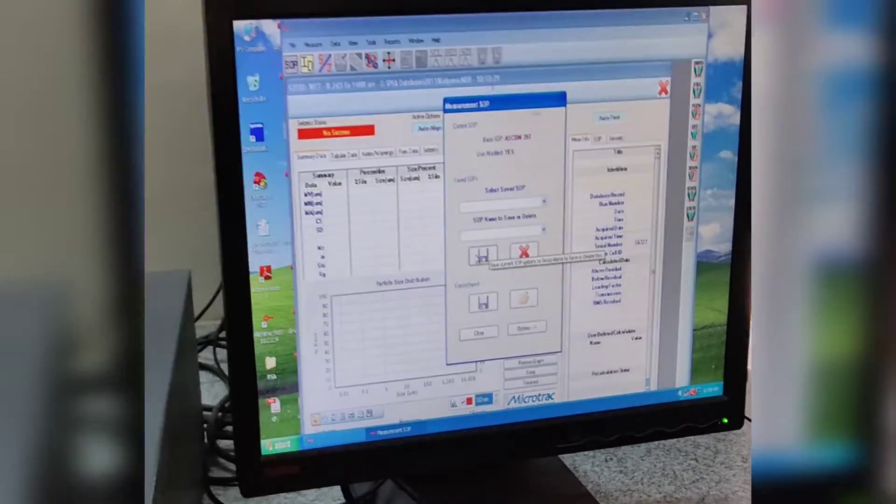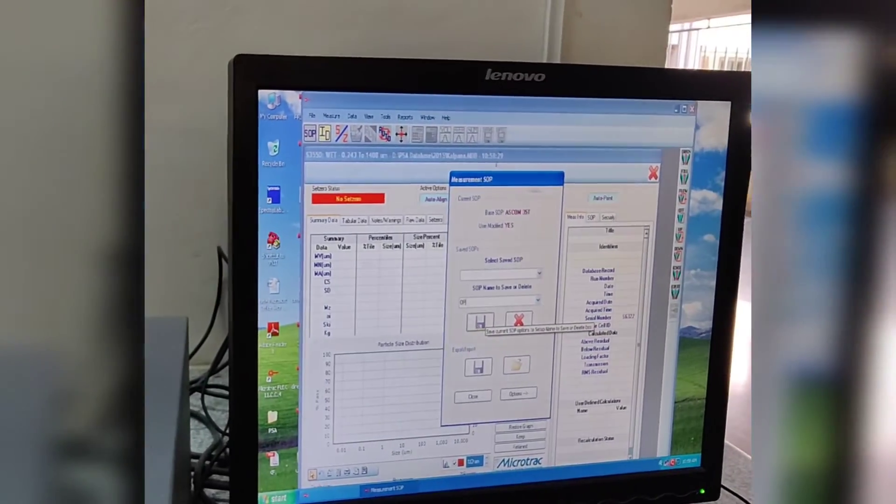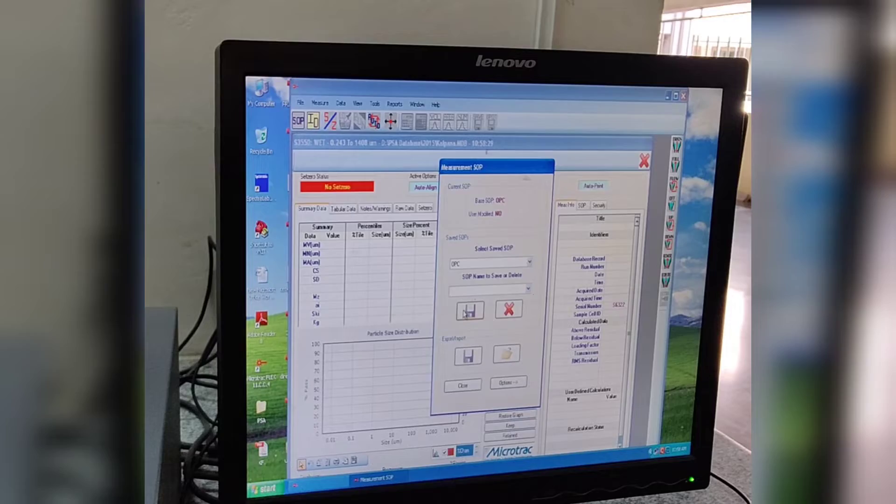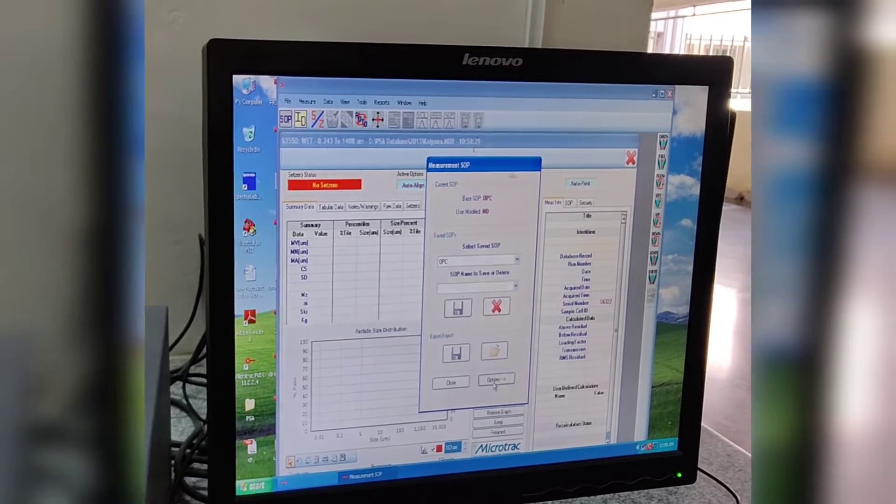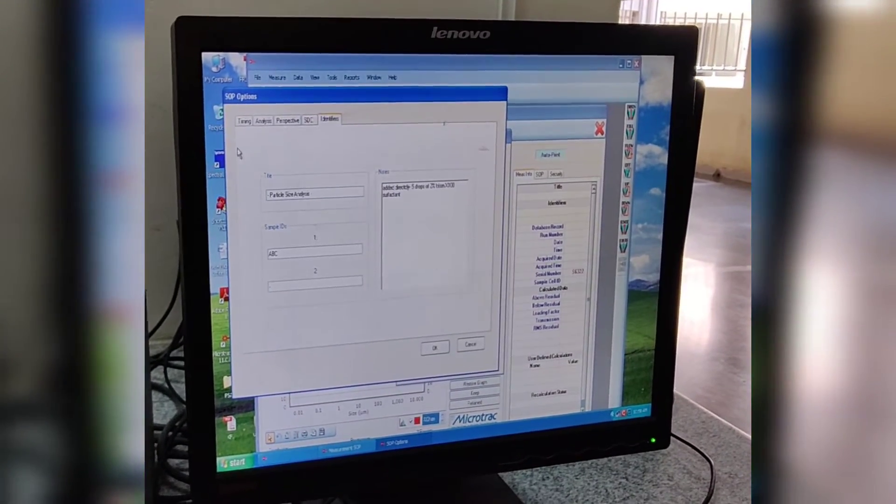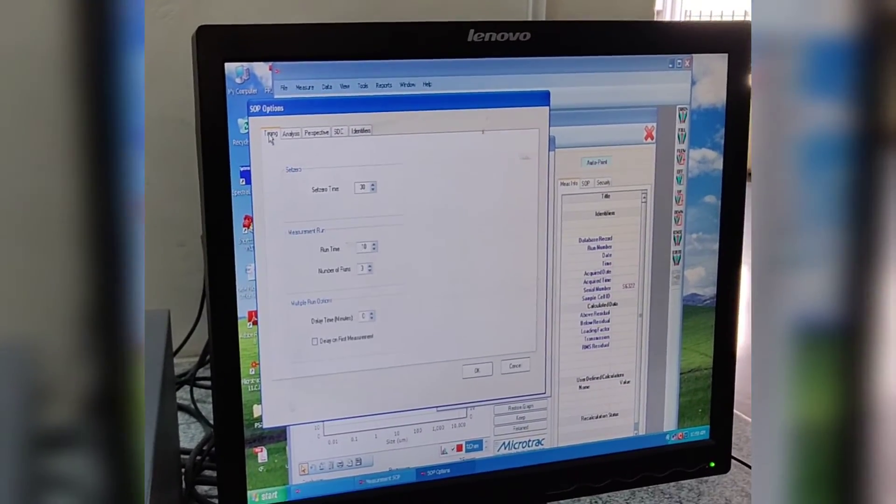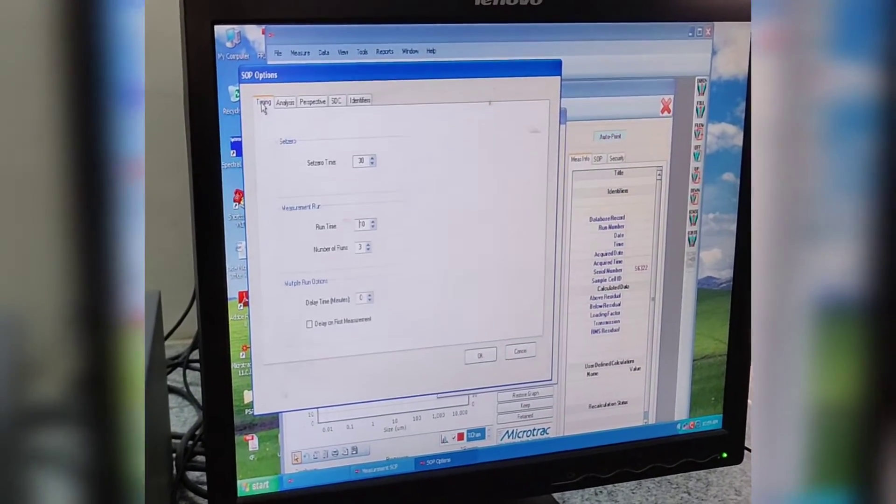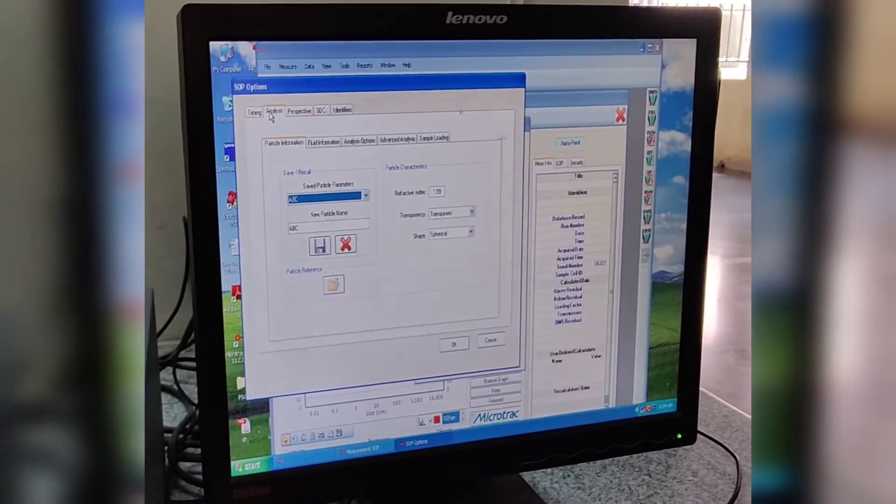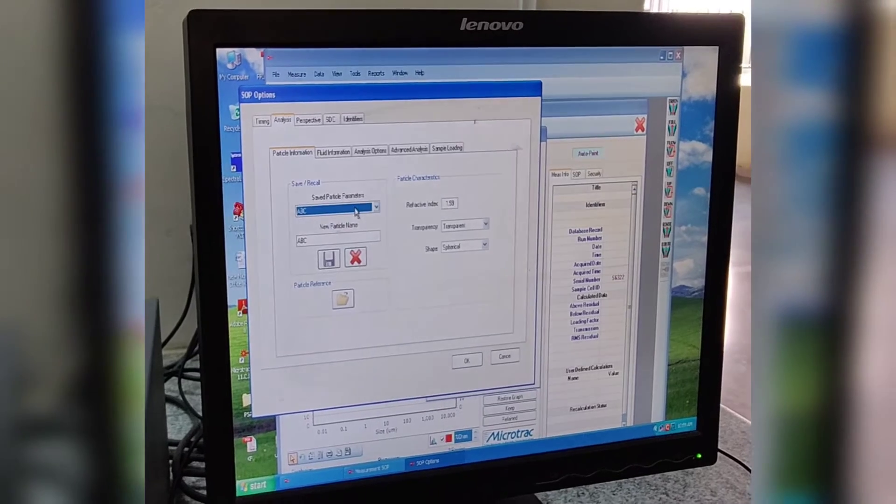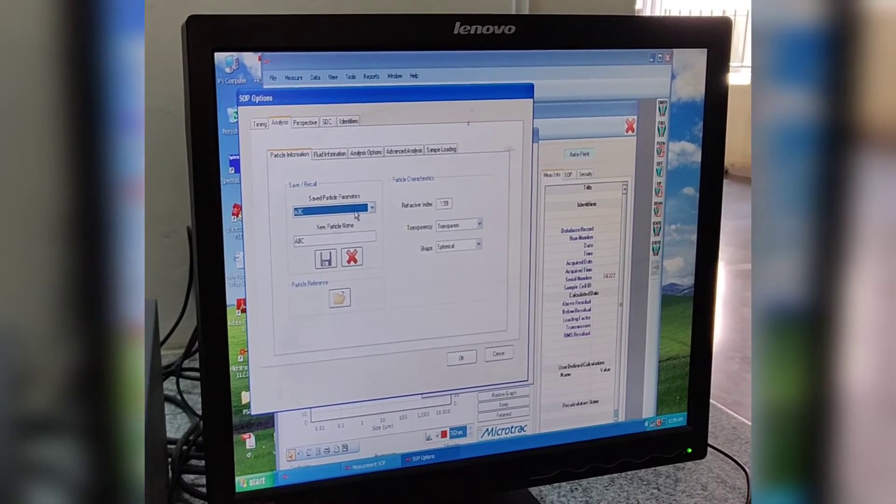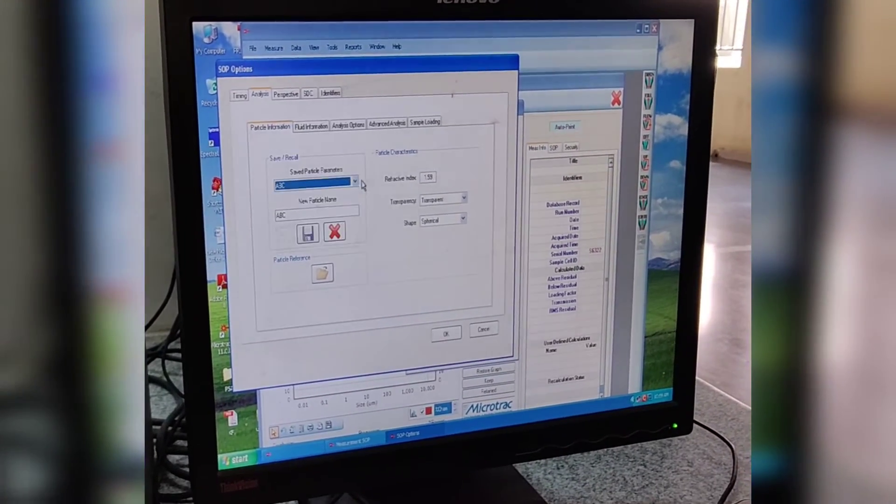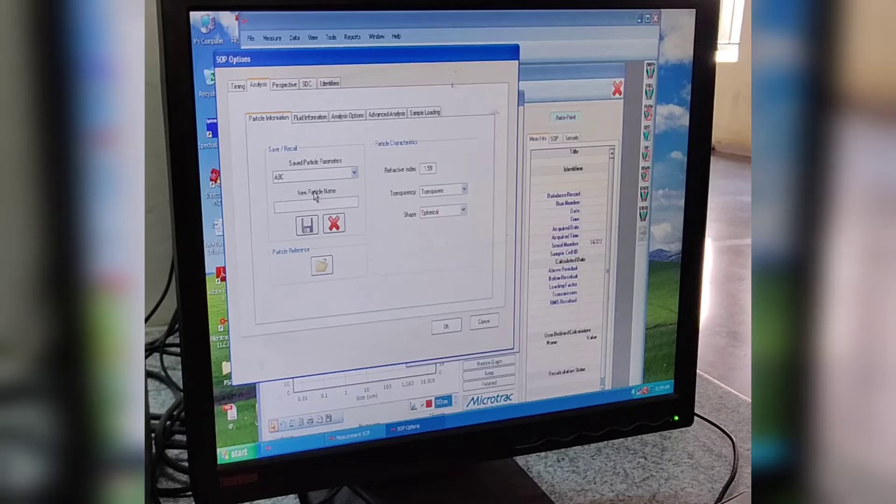We save an SOP for the sample and set the timing as 30 minutes for 3 observations. We add the refractive indices of OPC-53 cement, that is 1.70, and select the solvent as water. We set the other parameters and run the analyzer.